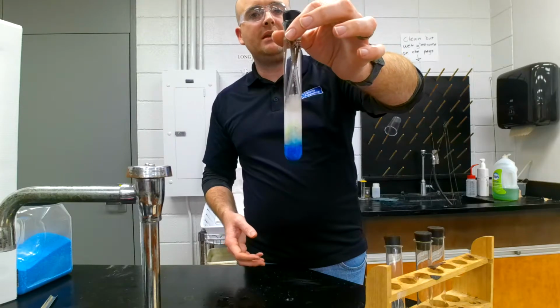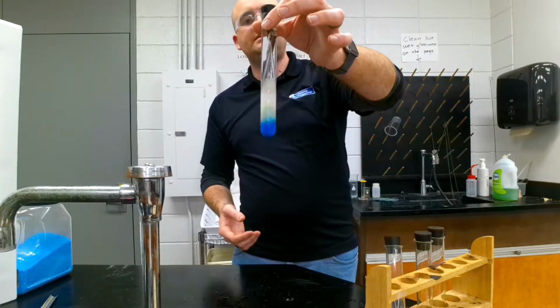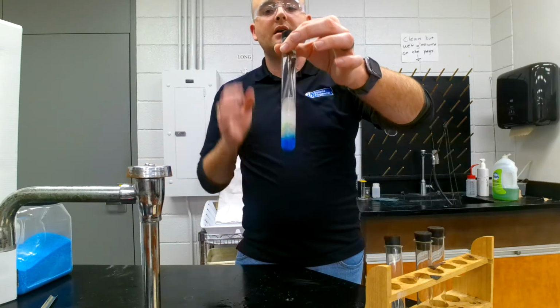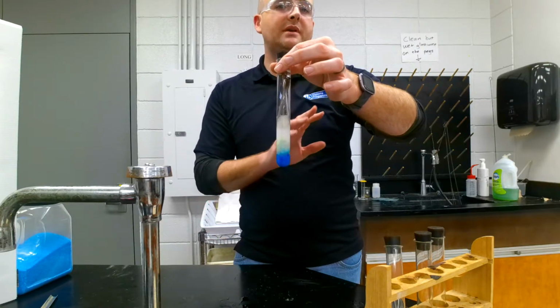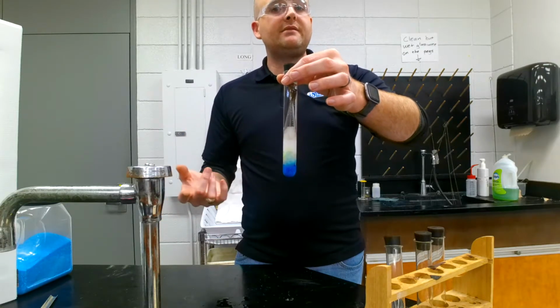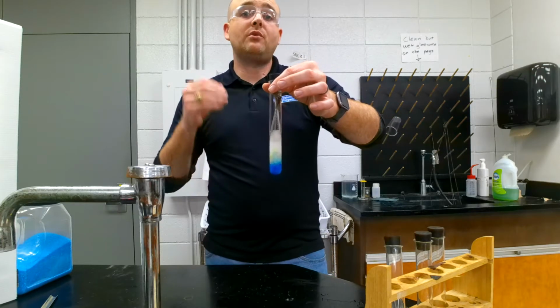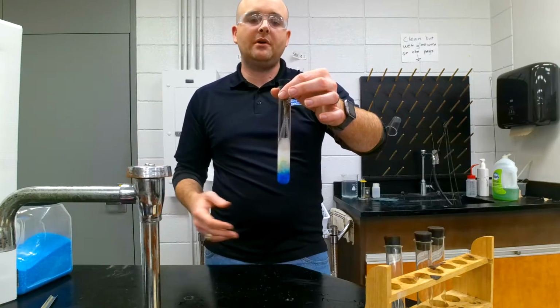It's not going to happen immediately, but after maybe a day or so, we'll take a look and see our observations at the end. Before you take a look at the next one, try to make a prediction. What is going to happen? Based on what you know between copper and iron, look at that activity series, see how those two are going to react with each other, which one is more reactive, and which one is going to end up being an ion in the end. Okay? All right.